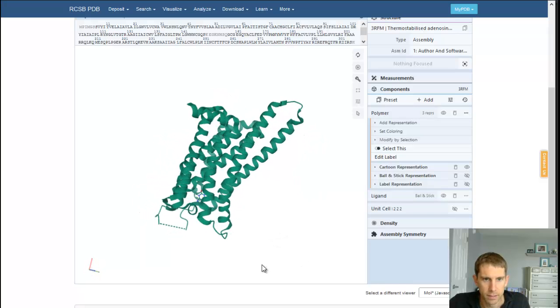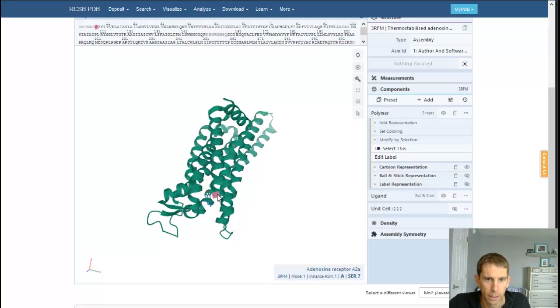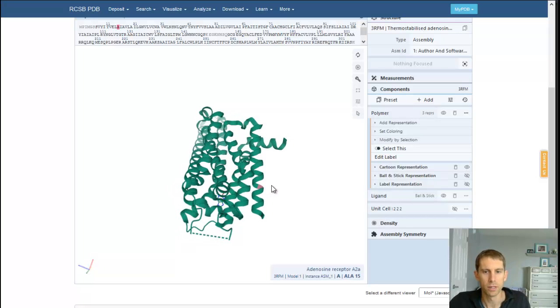And like we said, since we selected these and we had the number 7 here and we were over 300 here, it looks like of our sequence, for however this is chosen to be numbered, this is the first alpha helix structure, and I would say overall amino acid number 15, alanine, is very early in our first alpha helix structure for this protein complex.